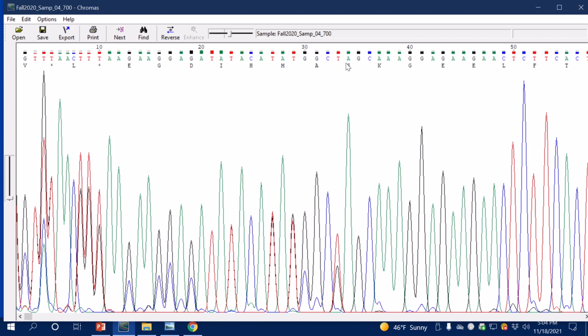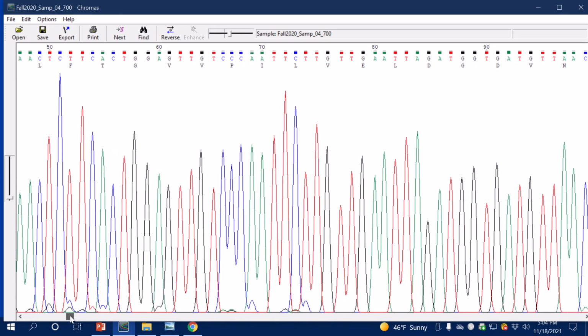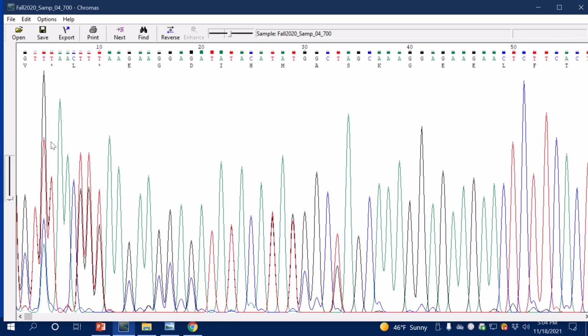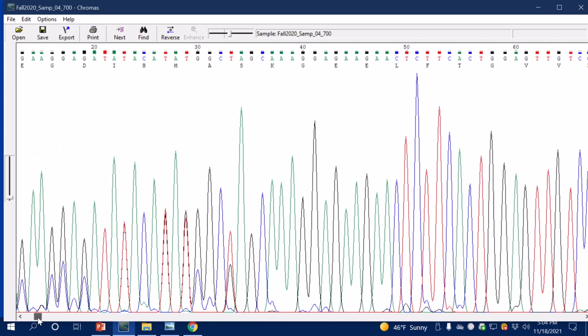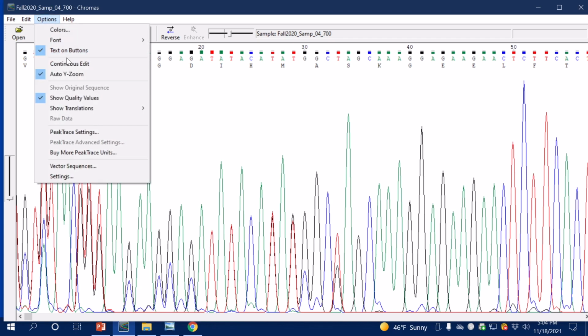So we know that whenever nucleotides get translated into an amino acid, it's a codon, or 3 nucleotides in a row, that determines what amino acid will be there. Now, whenever we are doing our sequencing, we don't necessarily know where our sequencing starts, or more importantly, where we start to get good data. So, for example, the first nucleotide in our sequence, we don't know if it corresponds to the first, second, or third nucleotide in its respective codon. So what we need to do is to figure that out.